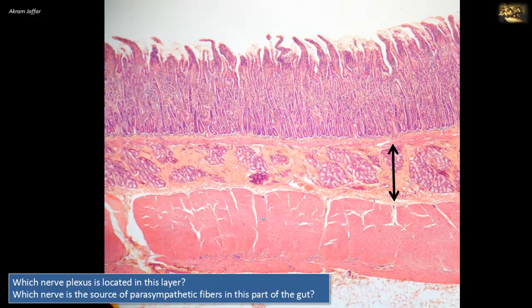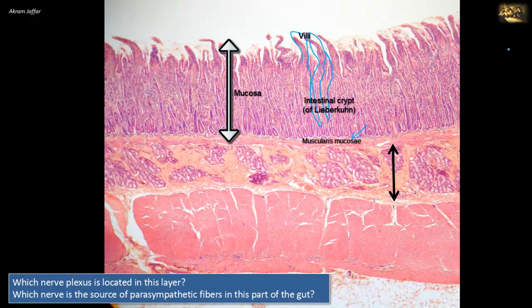First of all, let's identify the section. The section shows features of the small intestine, where the mucosal surface is made up of numerous finger-like projections — the villi — a characteristic feature of the small intestine. The mucosa in between the villi is formed into crypts. The deeper part of the mucosa is the muscularis mucosa, and the next layer deep to the mucosa is the submucosa, extending between the muscularis mucosa and the muscularis externa. In this part of the gut, the submucosa contains mucus-secreting glands — the Brunner's glands — the characteristic feature of the duodenum. So this section belongs to the duodenum.